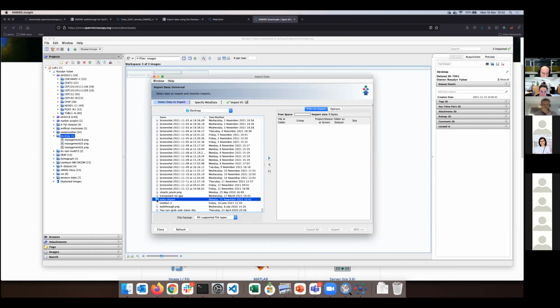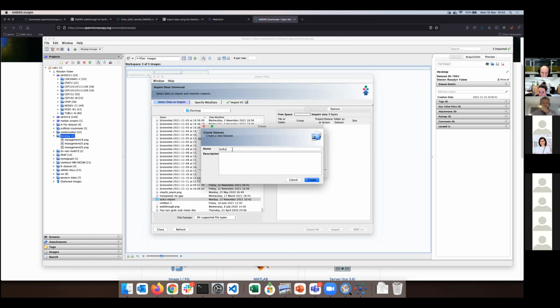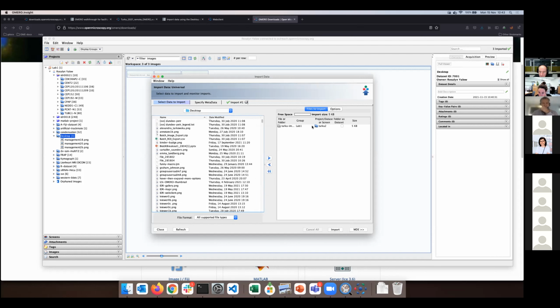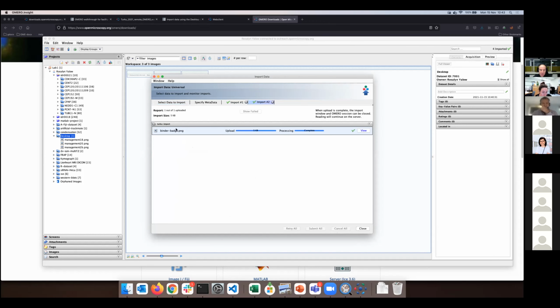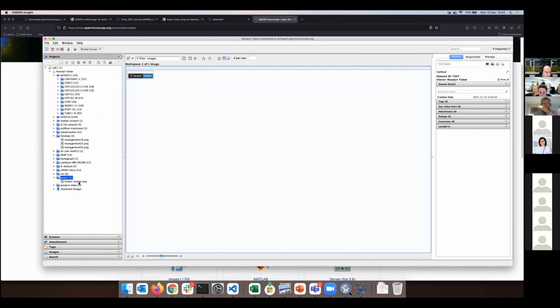Can you see? That's the folder. It contains, in my case, one image, but of course it could contain 100 or 2000. There is no limit in Omero. It will just show you a different UI. I will create a dataset, and its name is Turku2. Okay, say create, add to the queue. Now the whole folder with that many images as they are, in my case just one, will be imported into Omero. So this was my second import, and I'm having here the Turku2 dataset, which I just created, and the image there.